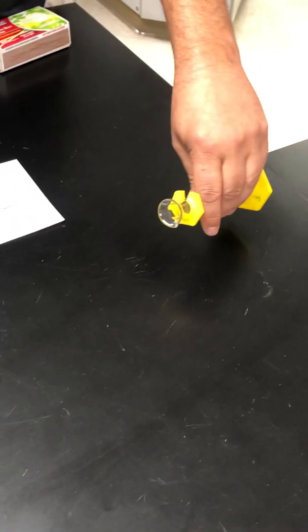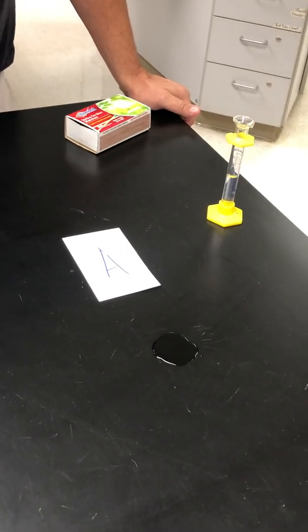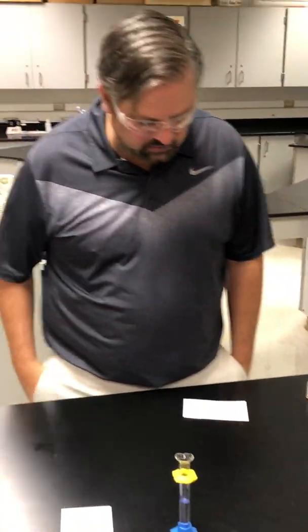And then if we pour a little bit out, we can kind of see how it flows, or the thickness. And the thickness, or the rate of flow of a liquid, is called the viscosity. So that one flowed out pretty quickly, so it would have a rather low viscosity.